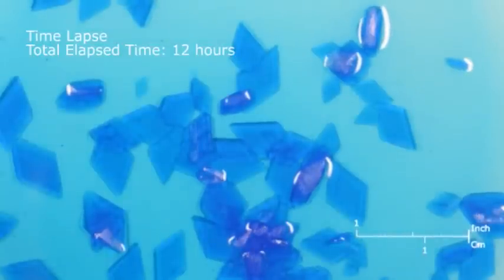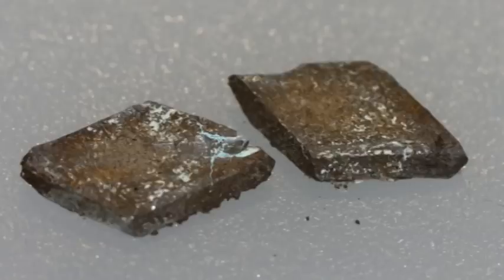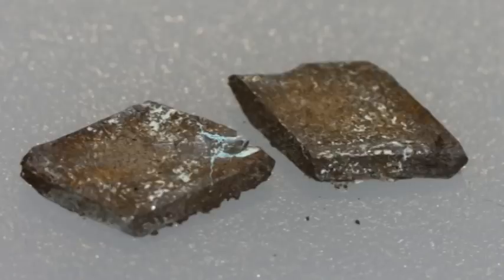Copper sulfate is an irritant, so wear gloves or rinse your hands immediately after handling the crystals. Unfortunately the crystals will not remain bright blue forever. As they dry out, a white to gray powder will form on the surface as the copper sulfate pentahydrate returns to copper sulfate. You can always dissolve your crystals in water and make new ones.